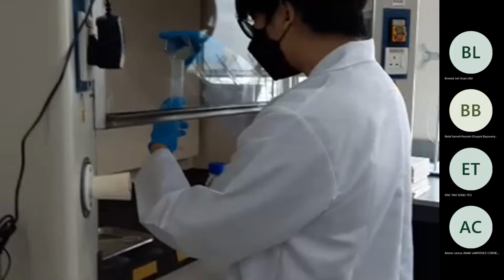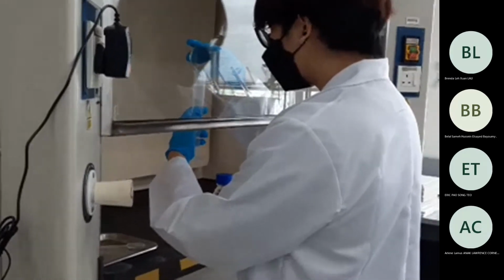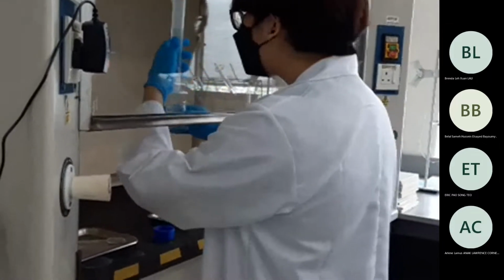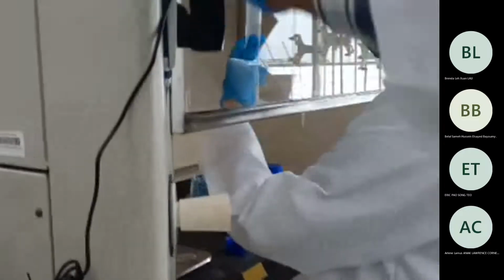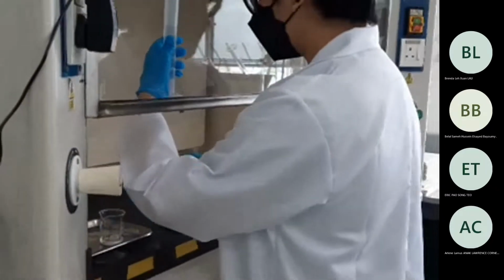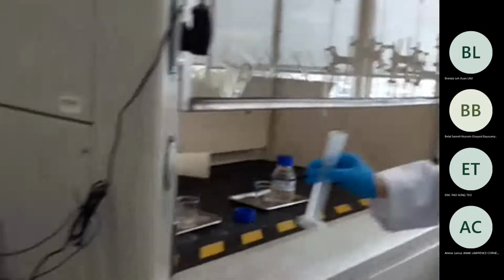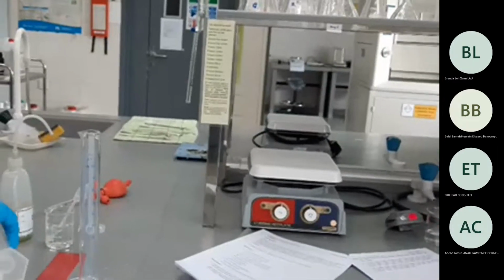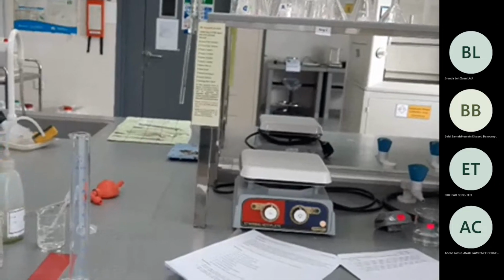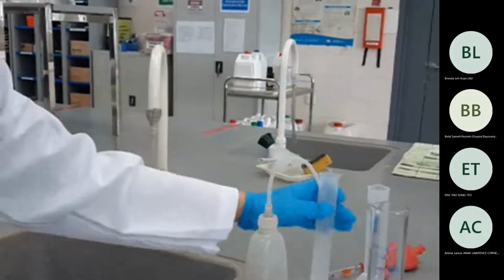Lynn, are you done? Waiting for this. Yes, you should use the same cylinder. Have you washed it? Okay, good. Oh, the light is actually not working. Okay. Add, yeah, just add. Oh, there are a few more drops. See, 4 drops came out.